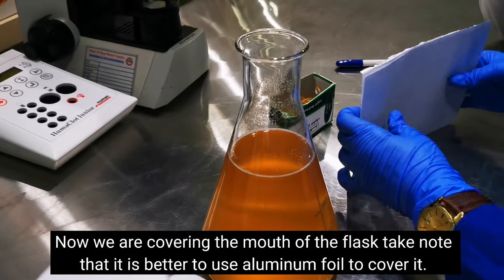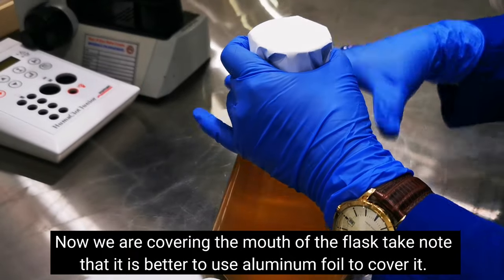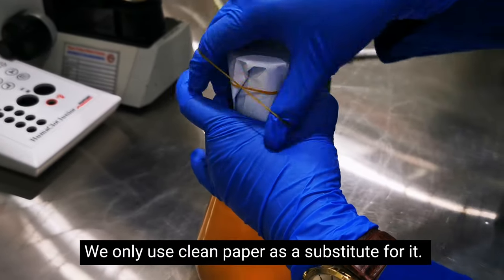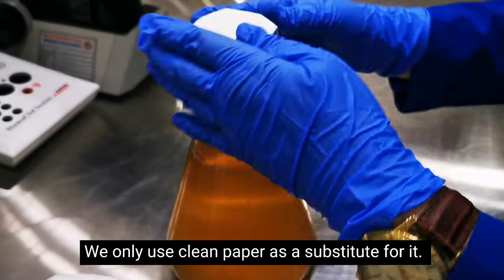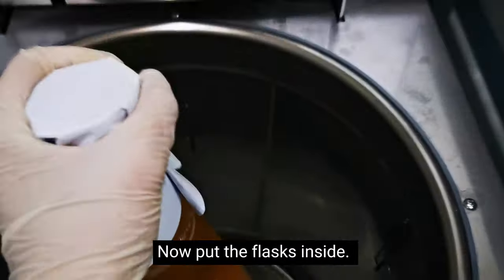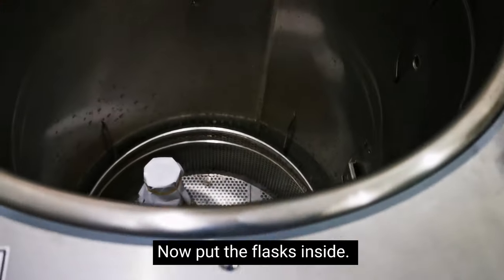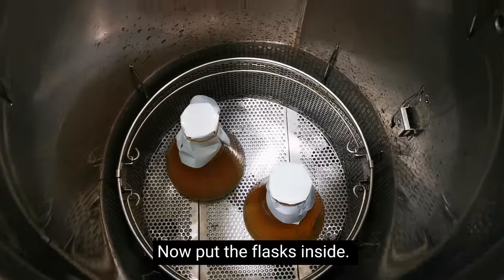Now cover the mouth of our Erlenmeyer flasks. We used clean paper and a rubber band, but aluminum foil would be better because even if it gets wet, it won't tear — unlike paper, which tends to tear when the top gets wet. We're using paper because we don't have aluminum foil, so we're improvising. After placing them, make sure they're balanced and not tilting.